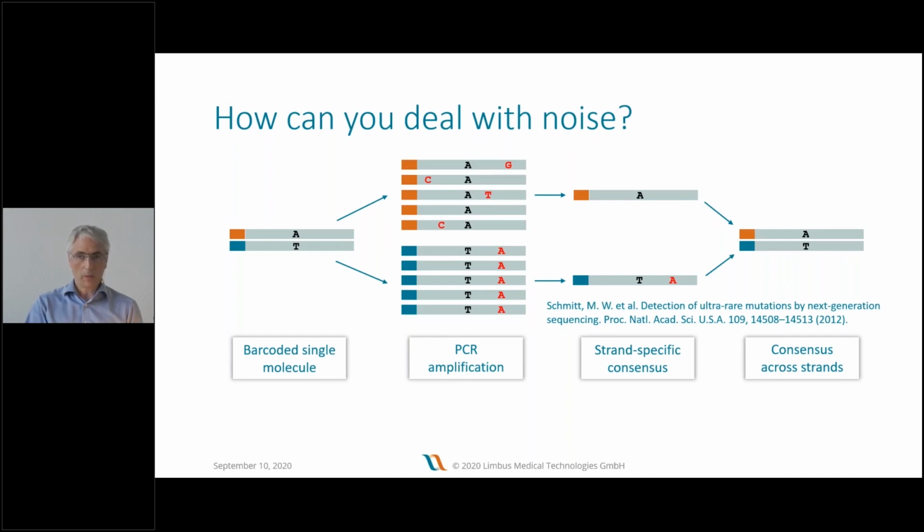And if you're looking at the error rate that you're encountering in your data, the second column in my diagram basically represents the regular data that you obtain from NGS sequencing, and a typical error rate in NGS sequencing is probably 1 in 100 down to 5 in 1,000.